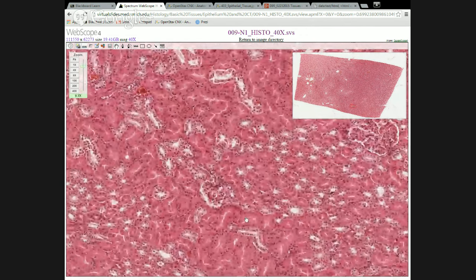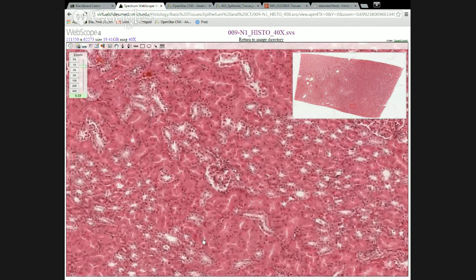And backing off a little bit more, really this tissue is made up of all of these types of epithelia. Some of them are lightly stained, some of them are more darkly stained, but they're all just sections of tubes. Some of them are nice round cross sections, some of them are at funny angles. But they're all going to have a little bit of empty space in the middle of them. And the edge of any cell lining an empty space is, by definition, the apical surface of those cells.